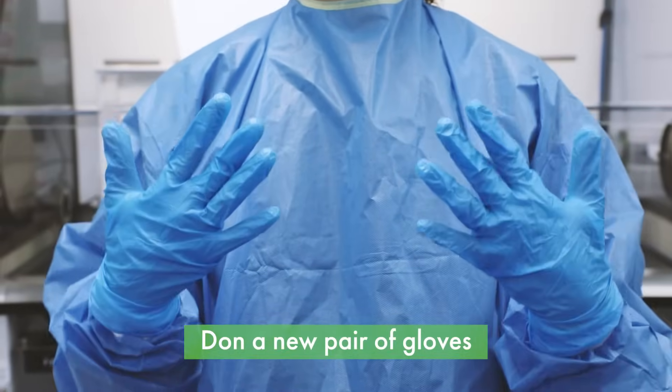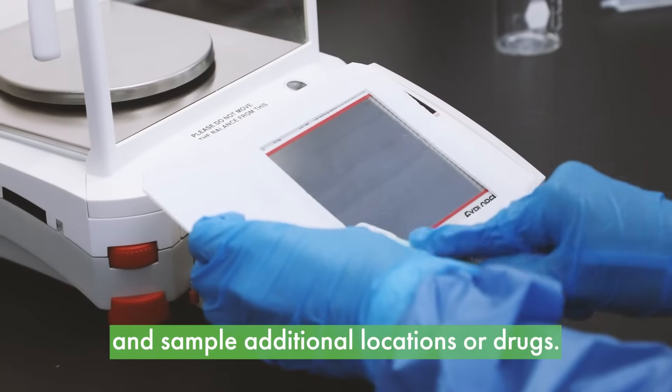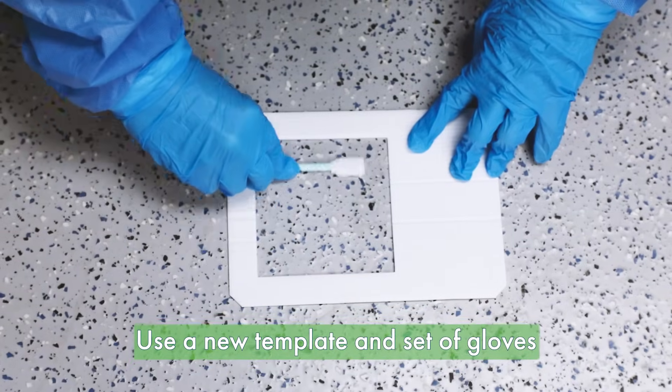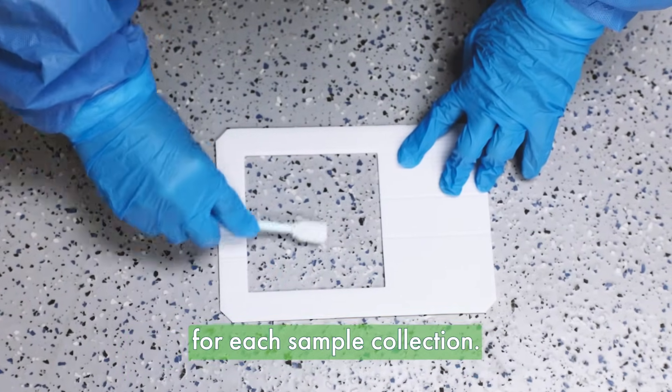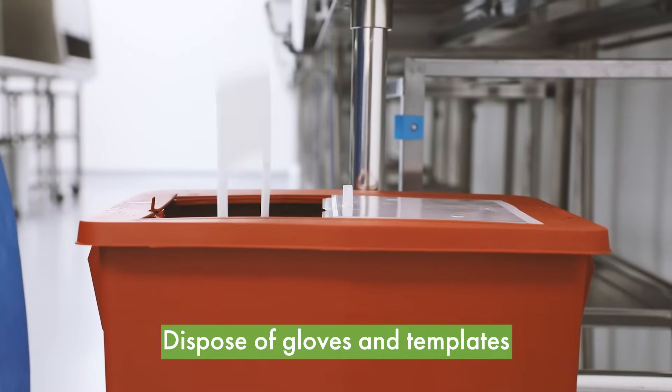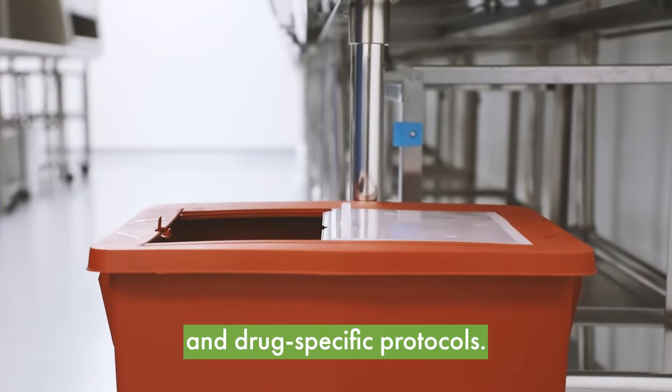Don a new pair of gloves. Repeat the process to sample additional locations or drugs. Use a new template and set of gloves for each sample collection. Dispose of gloves and template in accordance with your site and drug specific protocols.